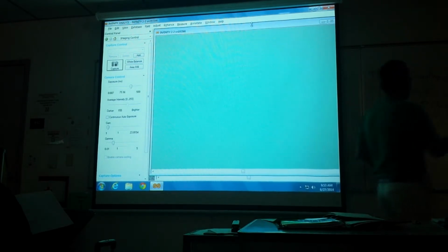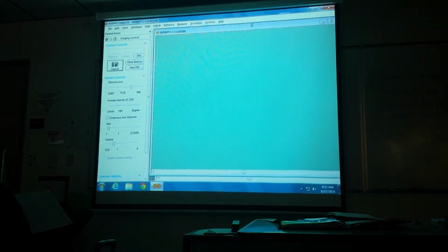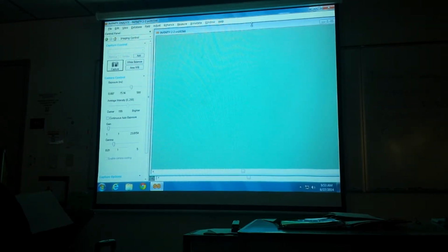By the way, I wrote the locations of where you can find these slides in our boxes. You can see there's 3 white boxes. It's either box A, B, or C. The number refers to the tray number, trays 1 through 12 in the box. The L or the R refers to left or right on the tray. So you can find it and put it back in the right place. Appreciate your cooperation.